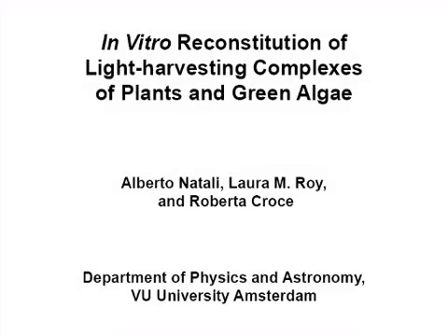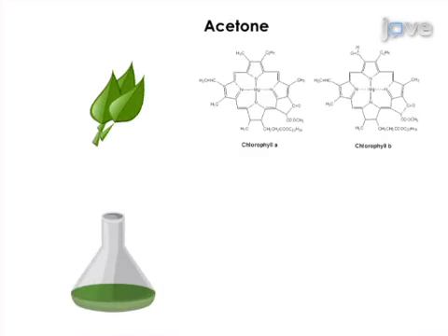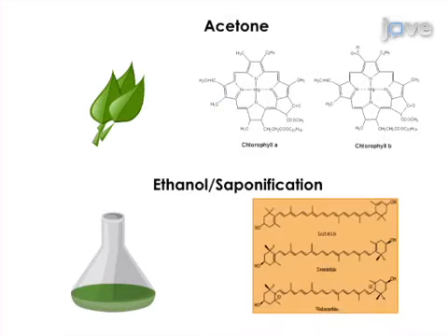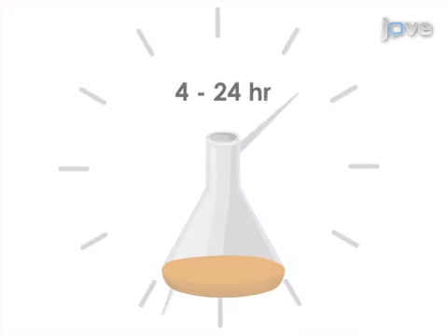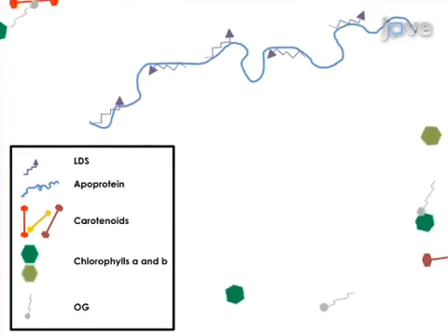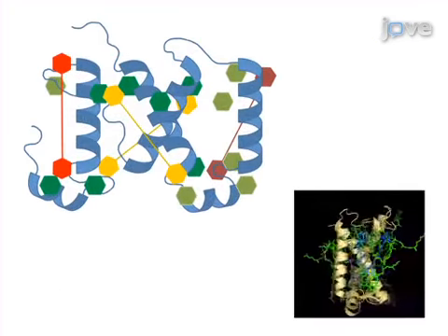The overall goal of the following experiment is to reconstitute in vitro light harvesting pigment protein complexes of plants or algae. This is achieved by extracting the pigments from spinach leaves or algae cultures and overexpressing the apoprotein in E. coli. As a second step, the apoprotein is mixed with the pigments to obtain a reconstituted complex.